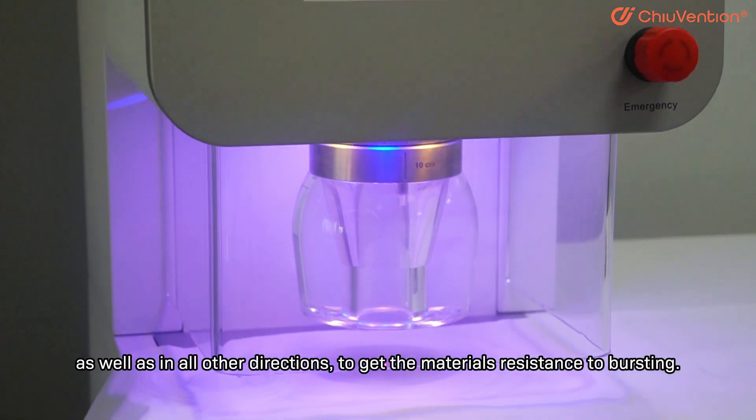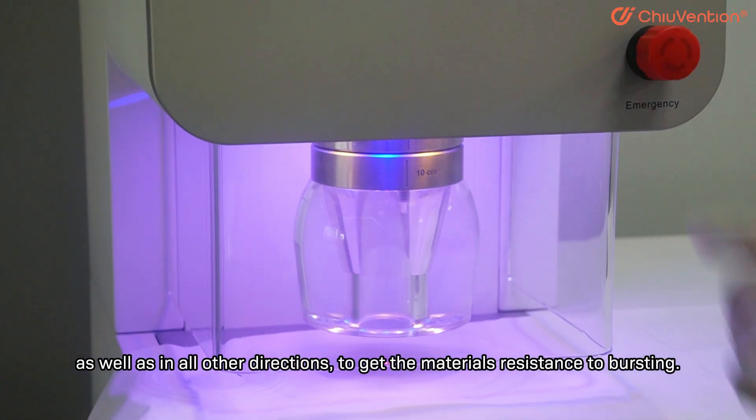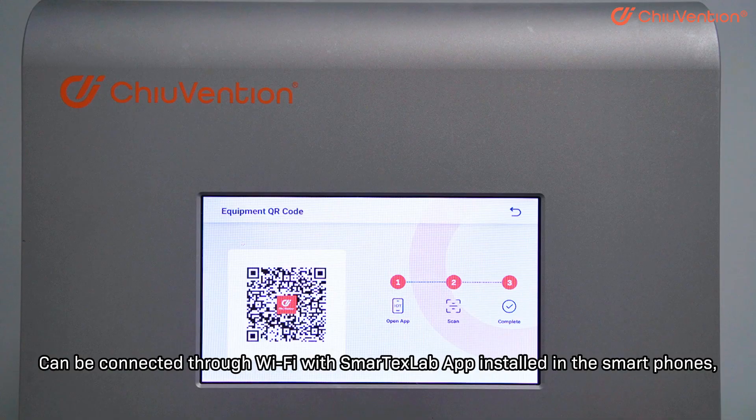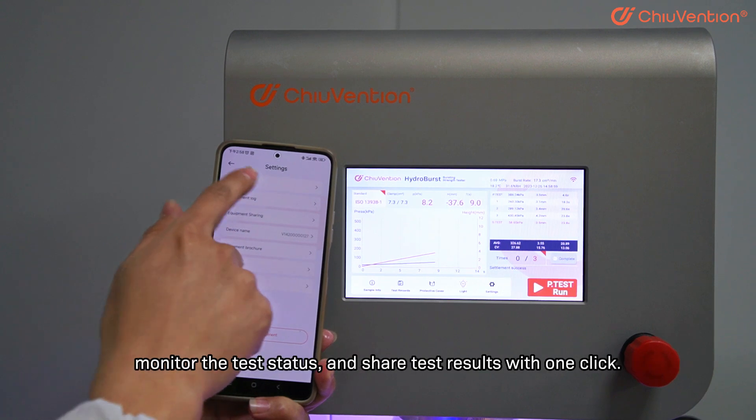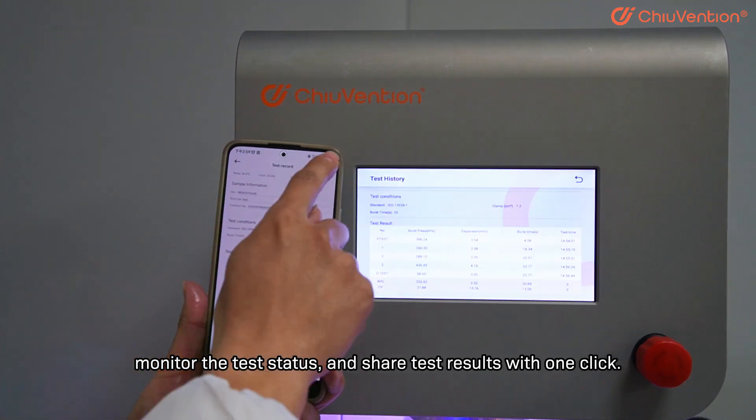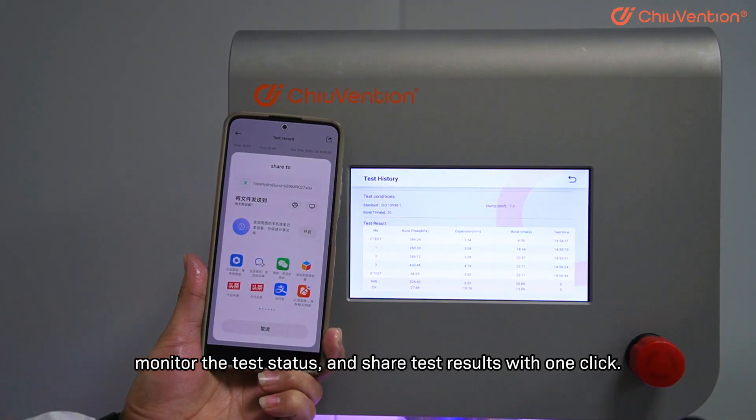The test measures material resistance to bursting in all directions. It can be connected through Wi-Fi with the Smartex Lab App installed on smartphones to monitor the test status and share test results with one click.